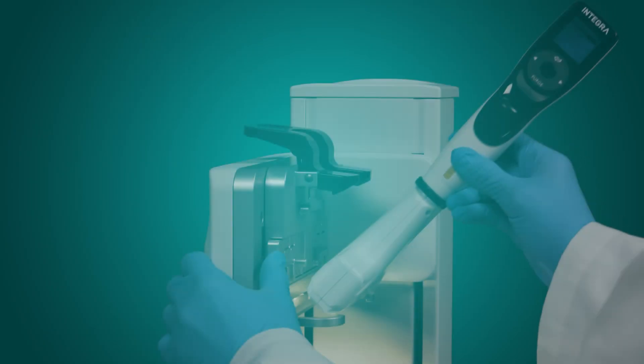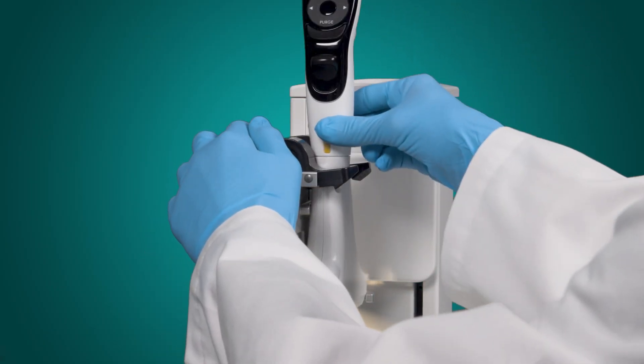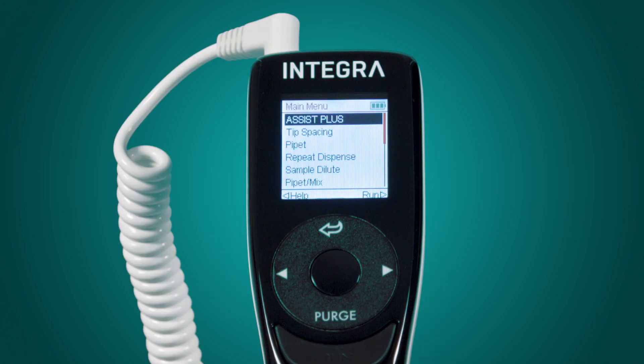After the pipette is installed, clicked in the Assist Plus, and a program is saved on the pipette, it's time to run the program.